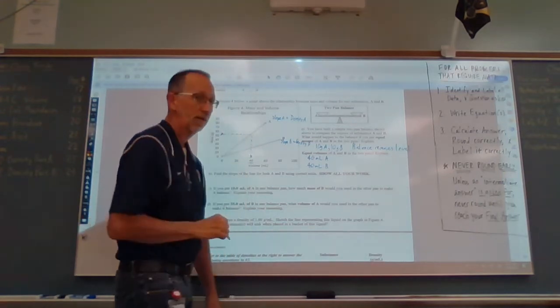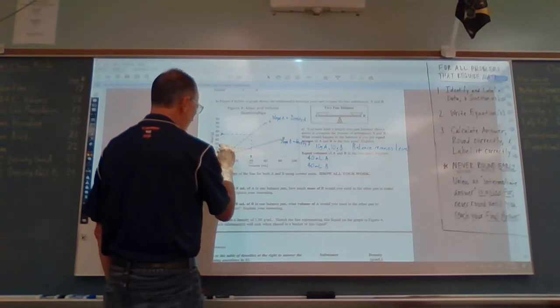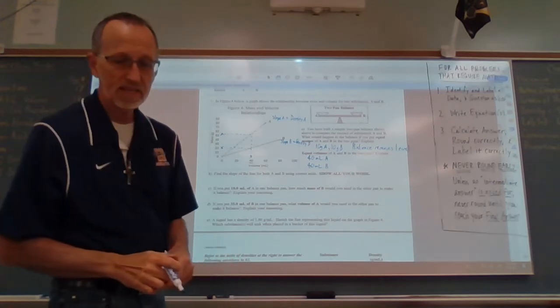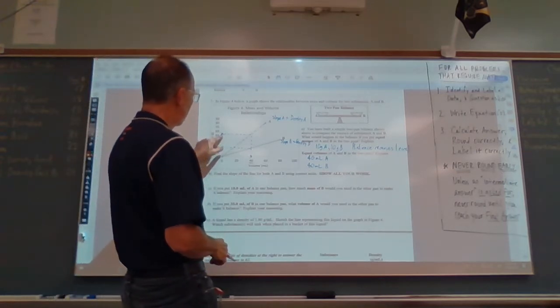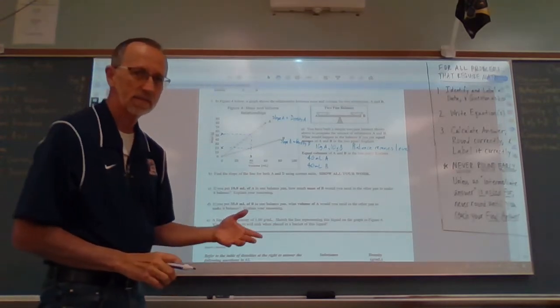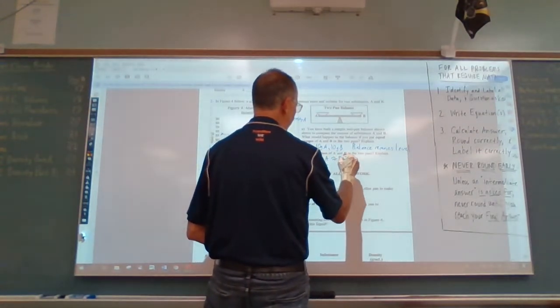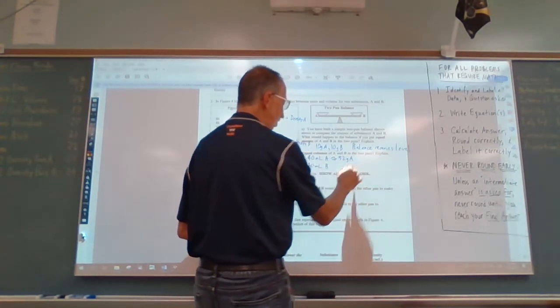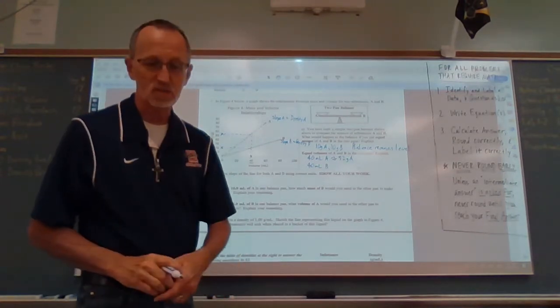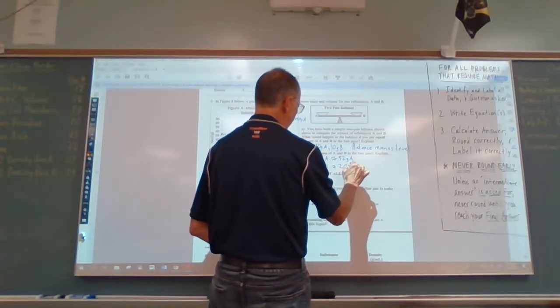Here's the mass of 40 mLs of A, and there's the mass of 40 mLs of B. Well, it looks to me like it's a little above 50. Again, these are to the ones place. So I'm going to say it's somewhere around 52 grams. I can't really say with certainty. It's subjective. And B looks pretty much like it's right on 20. So again, around 20 grams of B.